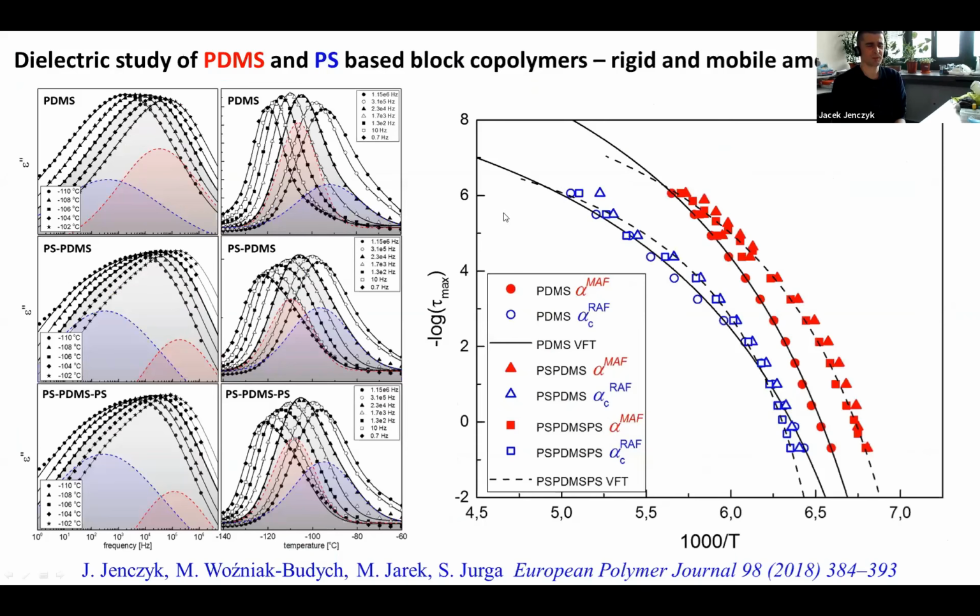And we also used dielectric spectroscopy to really trace the dynamics. Here, the so-called alpha relaxation or structural relaxation within the polydimethylsiloxane component.